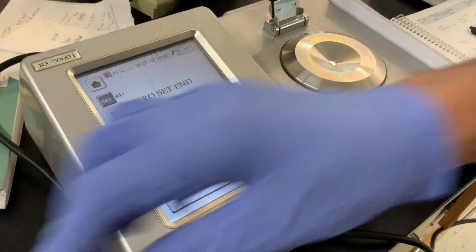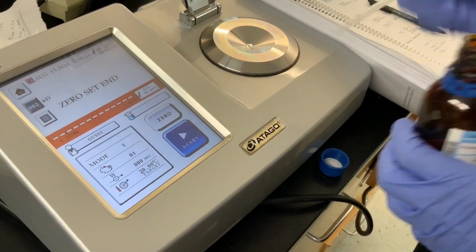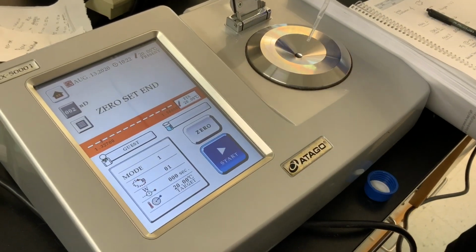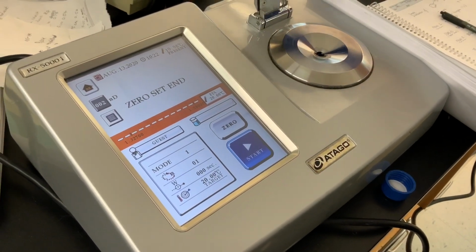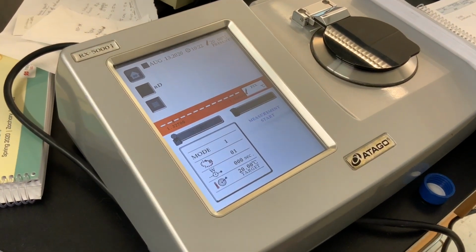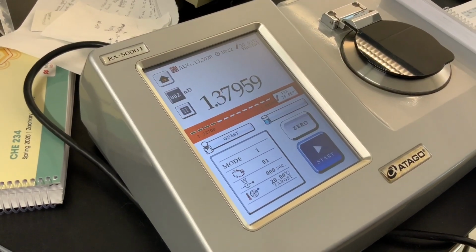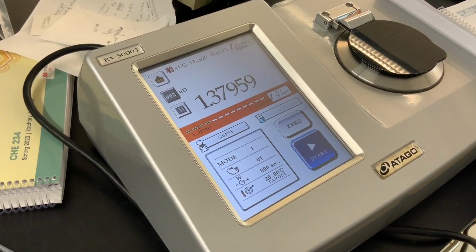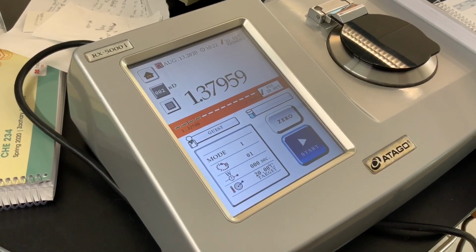Okay, so I've got my hexane, the same that we used, and I'm going to put a little bit in its lens area, which is right there. Cap it, press start, and then it does it for you. So it says it's reading, and it also gives a nice little chime. So this one says it's 1.37959.